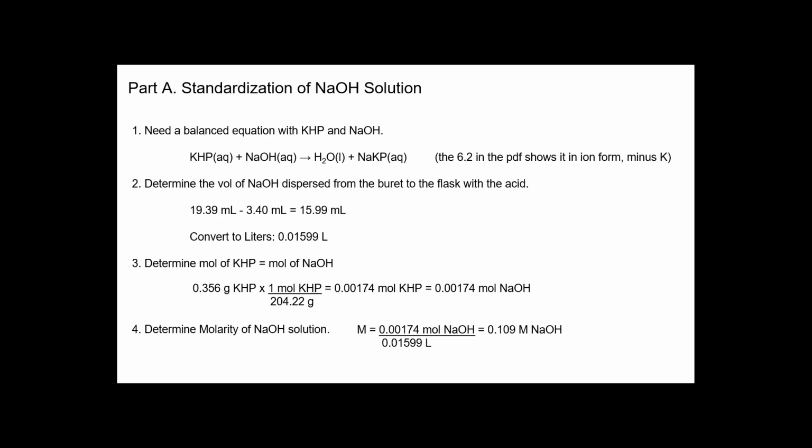So here are the steps to determine how to standardize sodium hydroxide. First things first, you need a balanced equation. Become fairly comfortable doing balanced equations. They are the one thing that will never go away in chemistry. You will do a lot of them in Chem 24B too, depending on what you're doing. So you should become fairly comfortable.